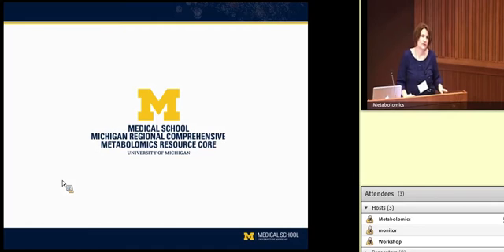I think you just have to read it very carefully, look at the whole experimental setup, and try to determine what they did. Sometimes the data in metabolomics is not necessarily quantitative anyway. A lot of it is relative quantitation. So in that case, they're probably just reporting precision and not accuracy. The standard error associated with any measurement may be based on the number of replicates, which is more of a precision measurement than an accuracy measurement. Does that answer your question?